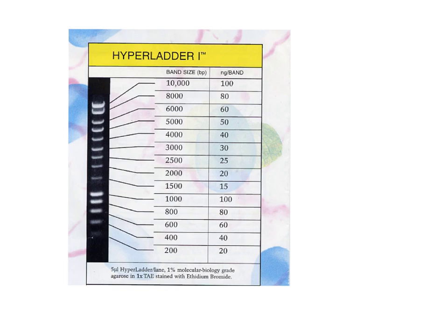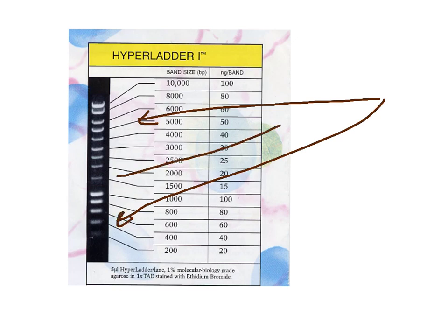So you can see these quite easily here and here and here. And you'll note in this DNA standard ladder, if you like, we start at 10,000 with quite an intense band at the top here, and we go 8, 6, 5, 4, 3, 2 and a half, 2, 1 and a half, 1,000.